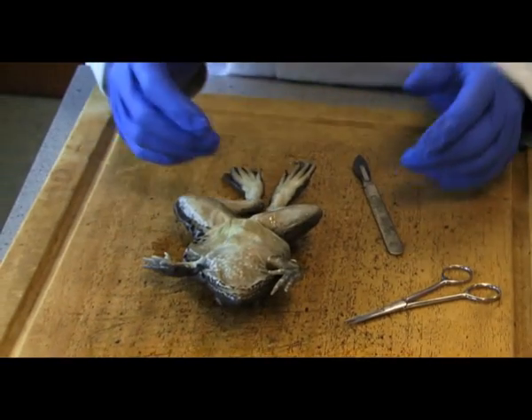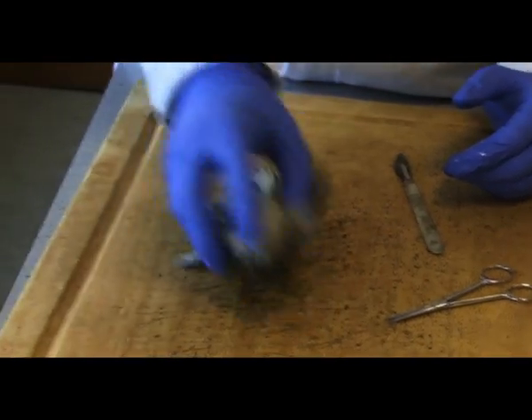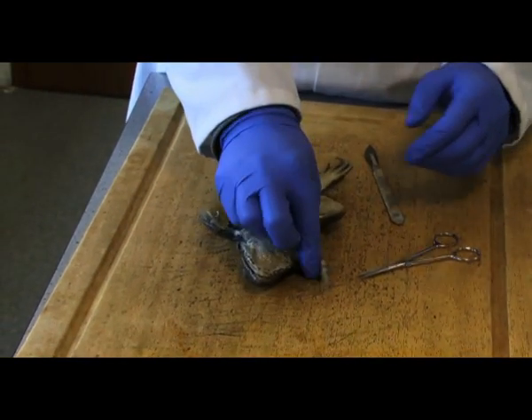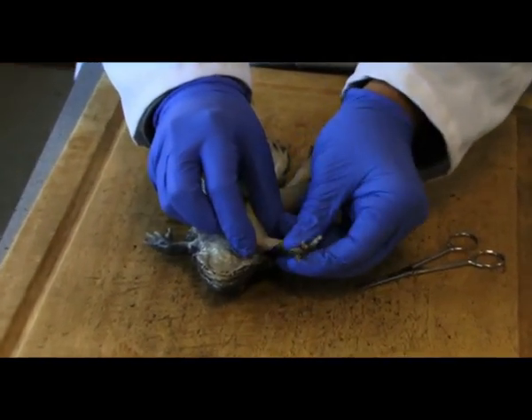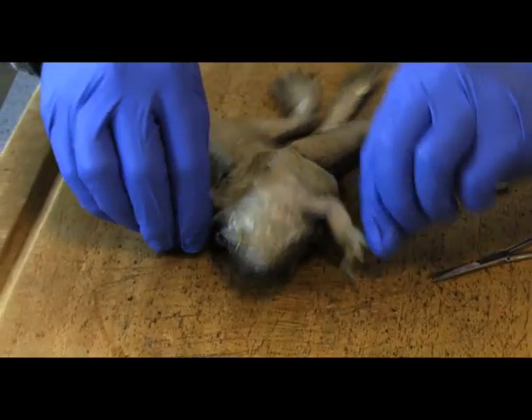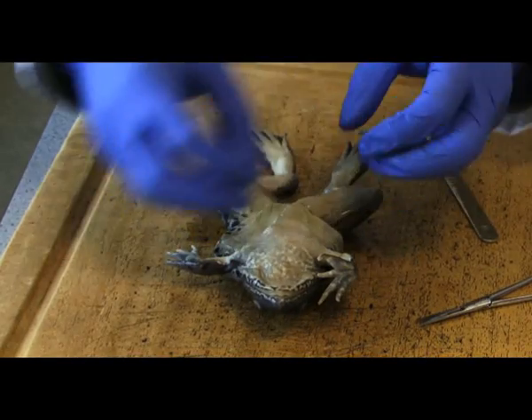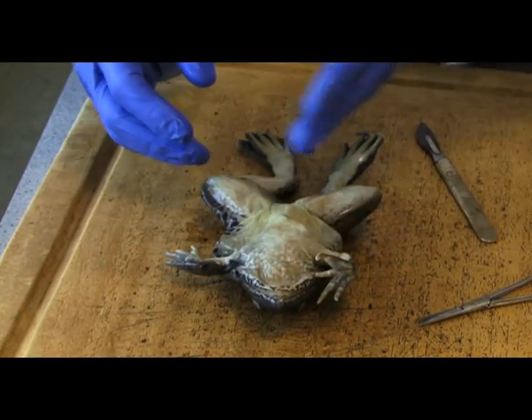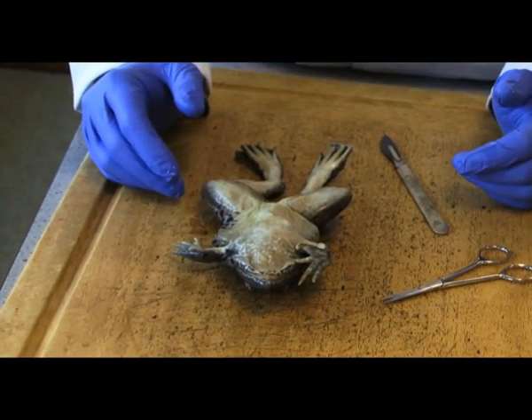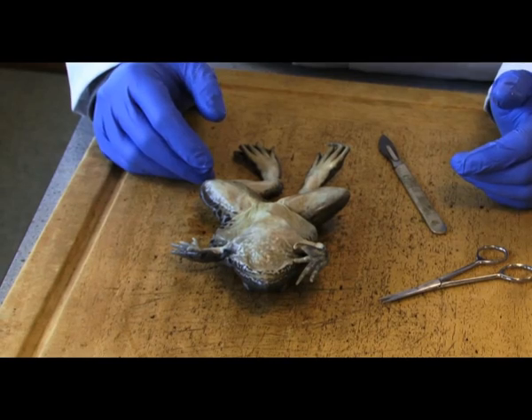First and foremost, when you've stabilized the frog on its back, what you want to do is try and make sure you can get the arms and the legs out as much as you can, because it makes it easier — it creates a tension on the skin, and then when you're doing your incision it makes it easier to open the cavities up and to obviously expose the various organs on the inside.